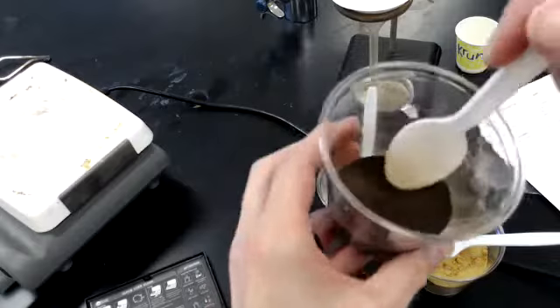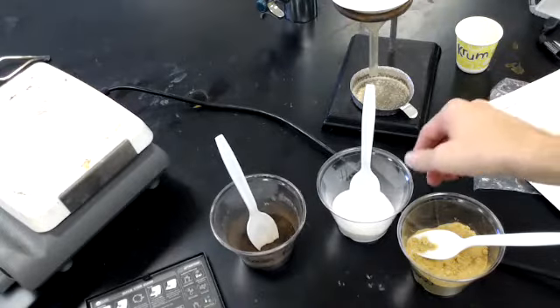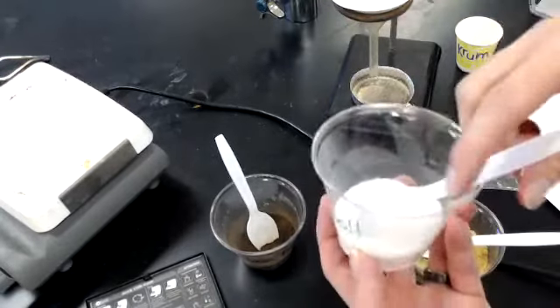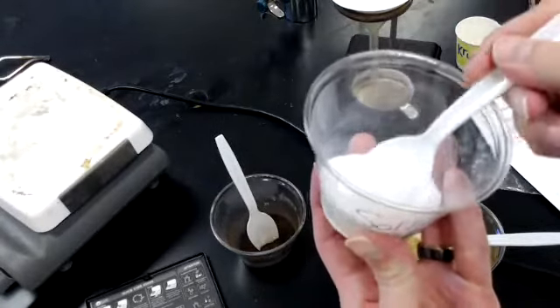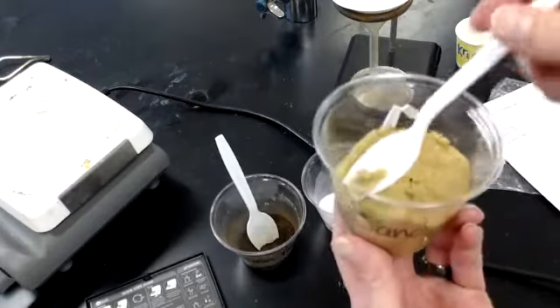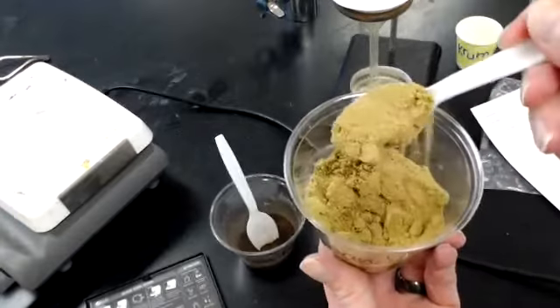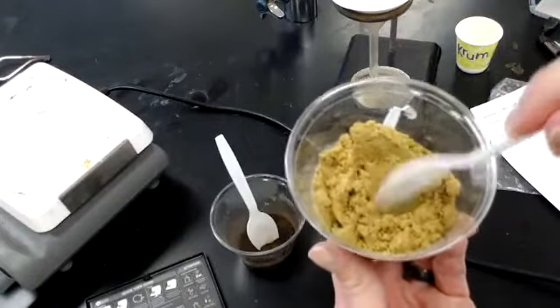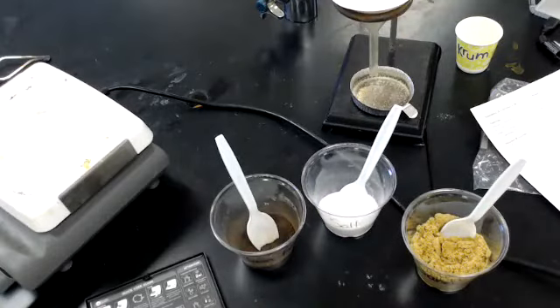Okay, so we practice making physical property observations in class. Then we have salt, and you want 3 physical properties of this salt. This is literally just the table salt that we normally have. And then we got sand, and you can have 3 observations of the sand I have here in this cup. So pause if you need to, and write down your observations. In this video, I'm not stopping, so pause anytime you need to so you can write stuff down.